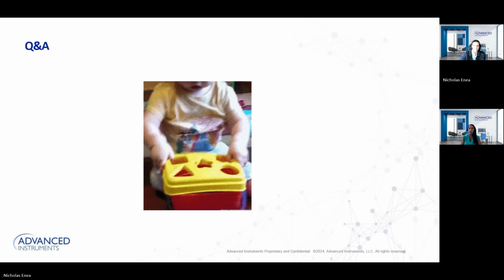That's why it's really important for folks not to just look for a roadmap that says this is what I should do, but to give some thought to how that pipette is used throughout the process and how it truly needs to perform, and not base it only on what a black and white piece of paper or electronic document might state. Lots of folks fall into that trap. Making an educated decision on what your tolerance should be when you're calibrating pipettes is super important.